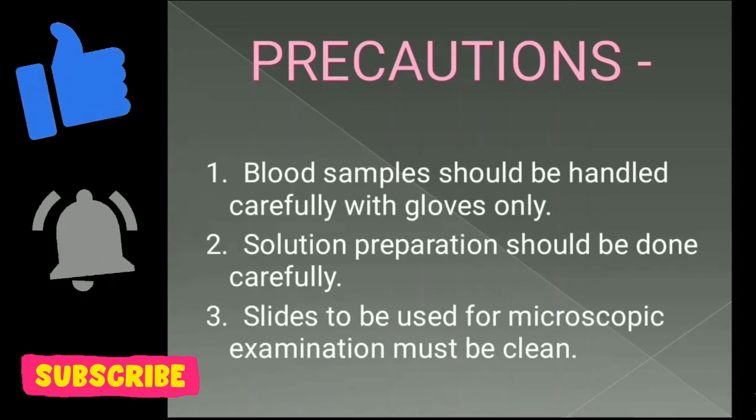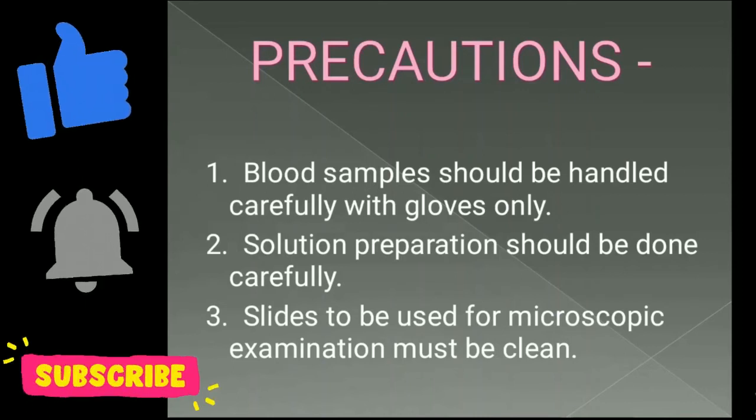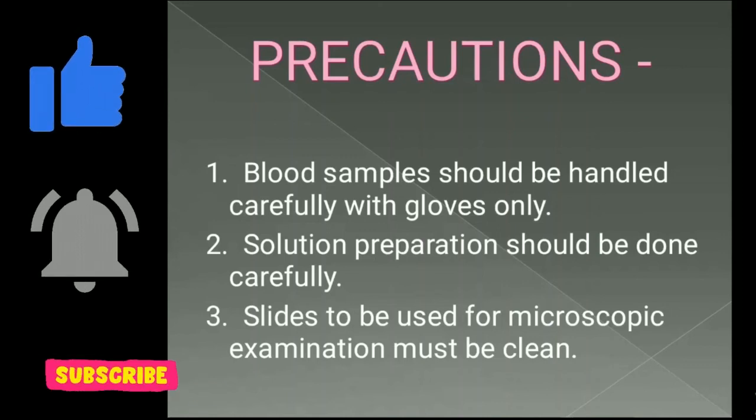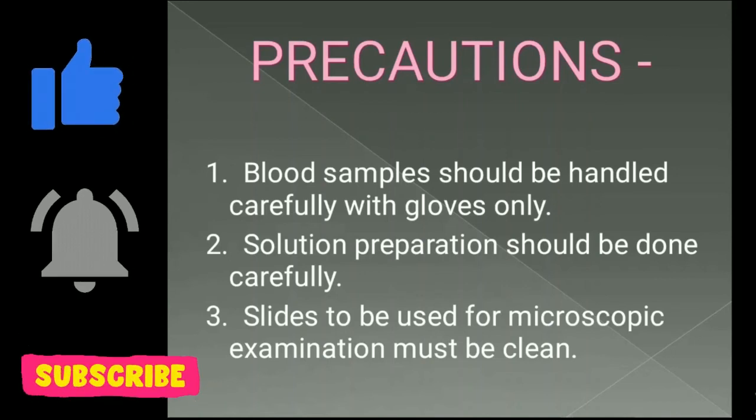So whenever you're performing this experiment, the following things need to be kept in mind. First of all, the blood which is to be collected should be handled properly while wearing gloves only, in order to avoid contamination.